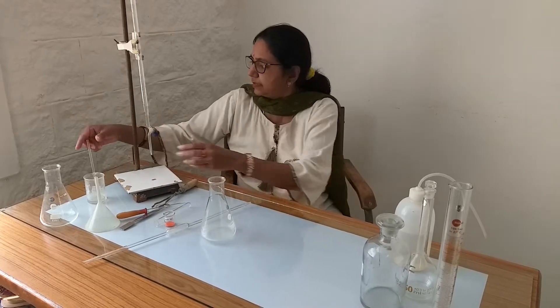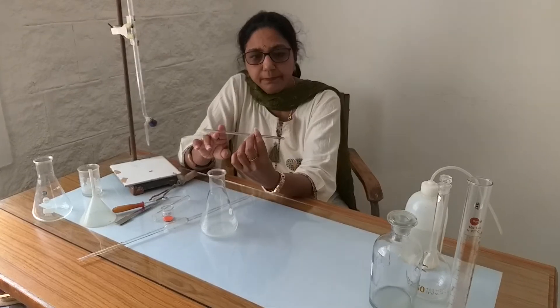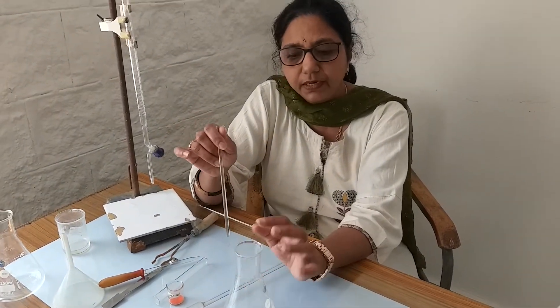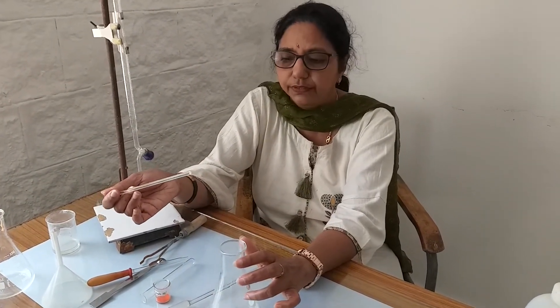This is a glass rod made of solid glass, used to prepare the solution. We take the salt in the conical flask or in the beaker, and after pouring the water or the solvent, we keep stirring with the help of this rod to dissolve it until it is completely in solution.